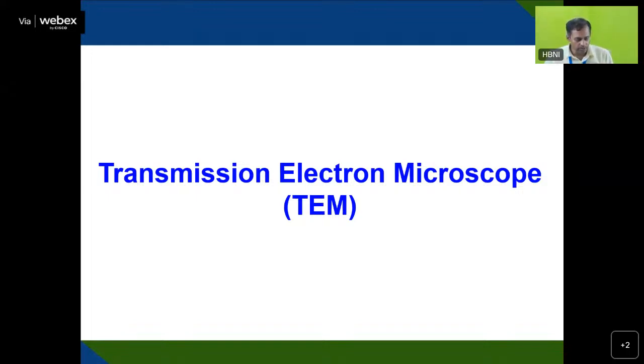So now we'll discuss the transmission electron microscope. The only difference from the scanning electron microscope is that there it used backscattered electrons or secondary electrons, and they raster scan the surface. But here, instead, the electron is transmitted through the material, and then you get an image at the bottom, where you have a detector that is able to detect it and you get that image here.